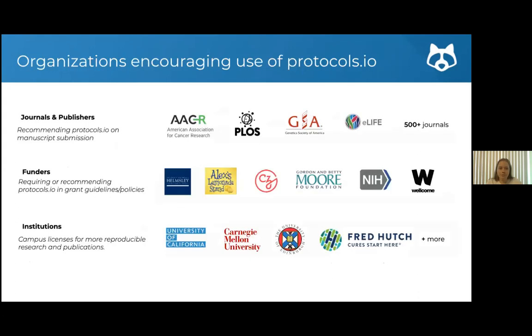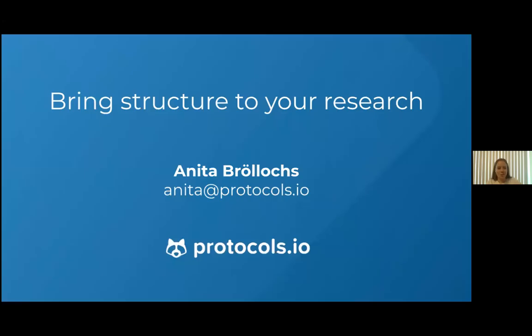And I would like to finish off by just mentioning that there are a lot of organizations encouraging the use of protocols.io. That includes journals and publishers that are recommending protocols.io on their manuscript submission. It includes funders that are requiring or recommending protocols.io in grant guidelines and policies, but also more and more institutions are getting campus-wide licenses for more reproducible research and publications on campus. And yes, with that, I would like to open it up to questions if anybody has any questions.